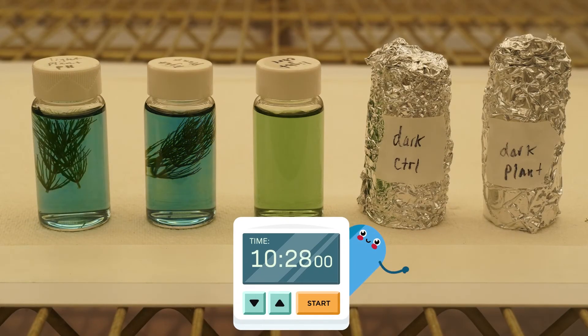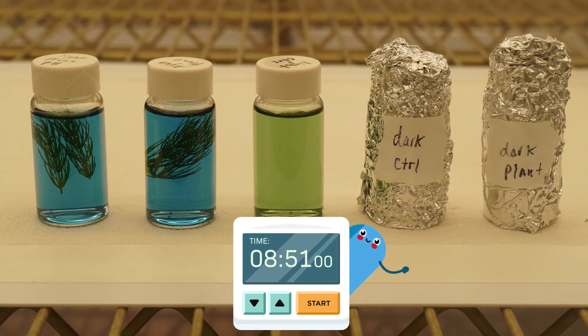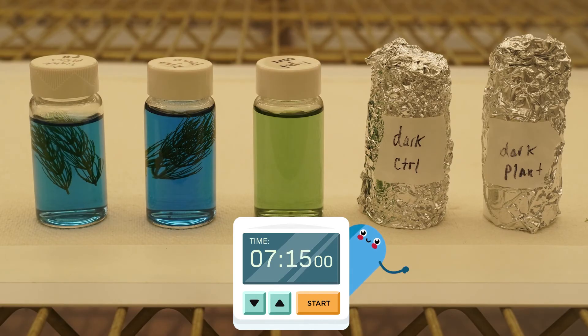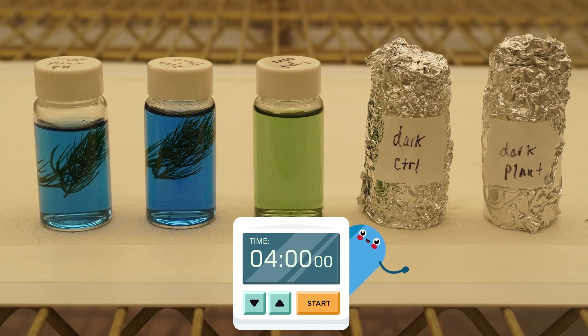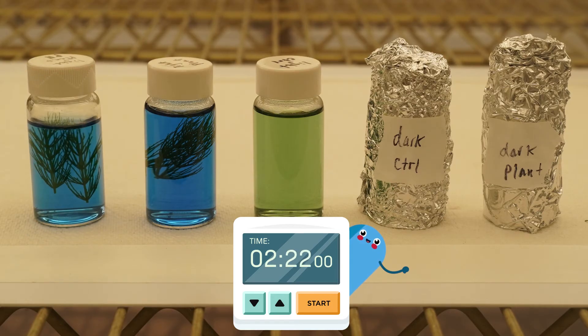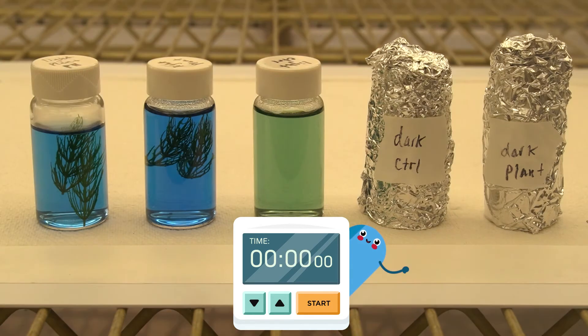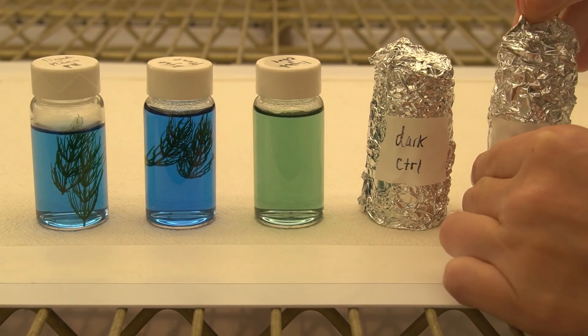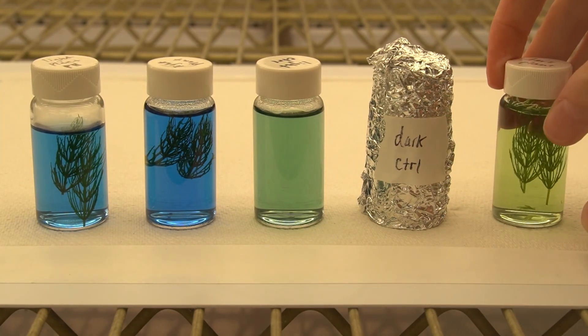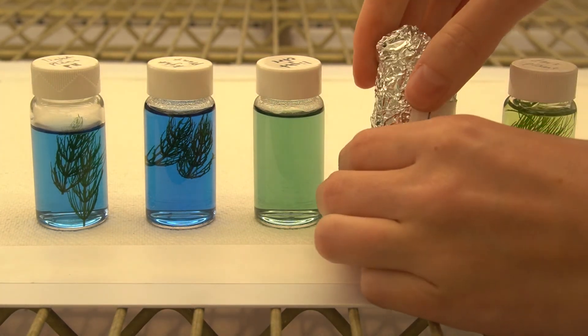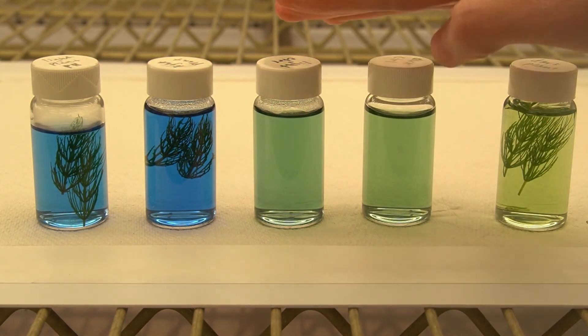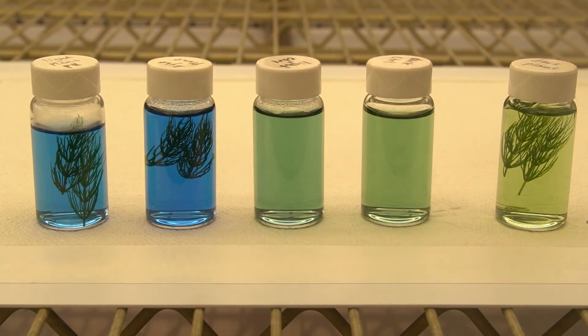Now let's go back to our vials and observe what the BTB indicator is doing over the course of 12 hours. Well, look at that! Okay, by the end of the experiment, the light plant vials have shifted from green to a rich blue color. Let's take a look at what happened to the dark vials. Alright, look at that! Our plant vial has gotten yellower! And for both light and dark treatments, our empty control vials stayed green.